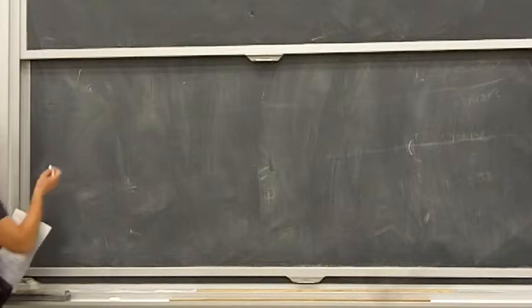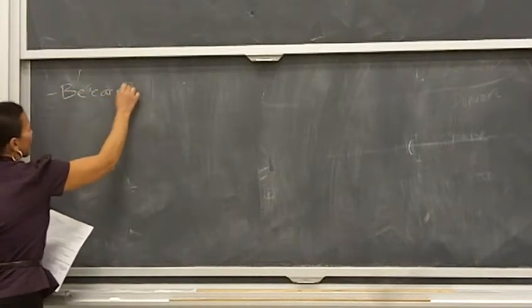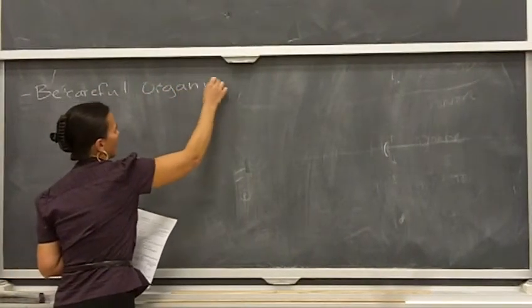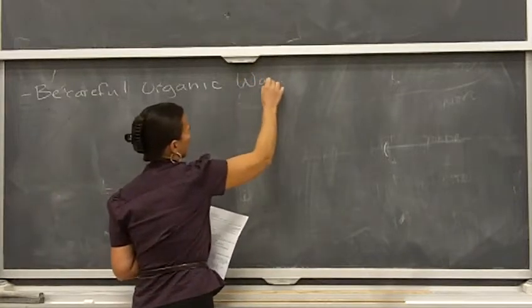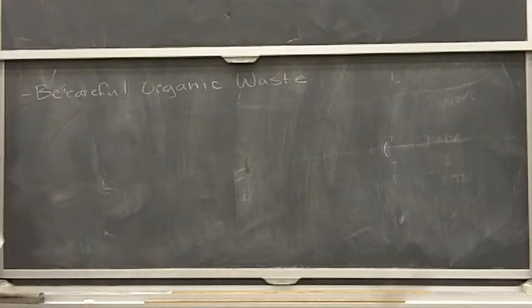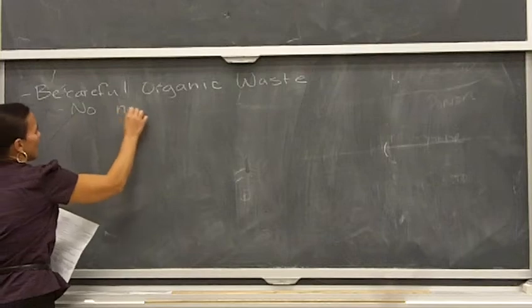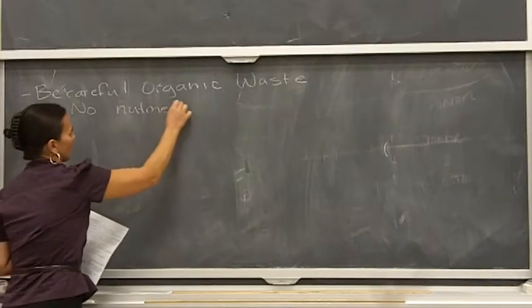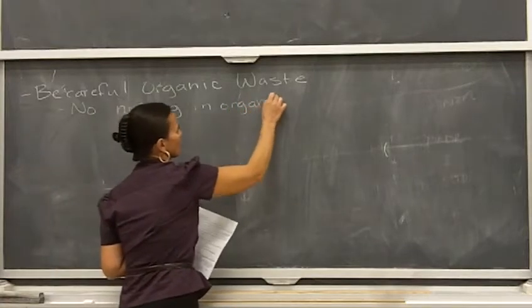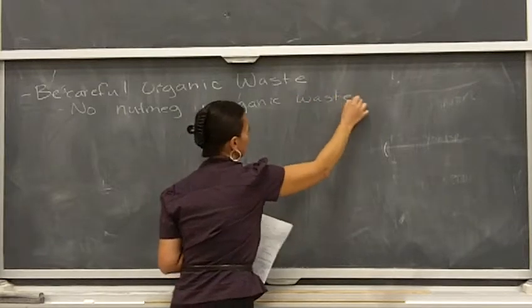Couple things to be careful with. First of all, be careful with the organic waste. We're getting 2 layers in our organic waste, which is not good. So make sure that you're careful with the organic waste, not to get any water in the organic waste. The other thing is also make sure you're not putting any nutmeg in the organic waste. If you find any remnants of nutmeg, don't put that in the organic waste.